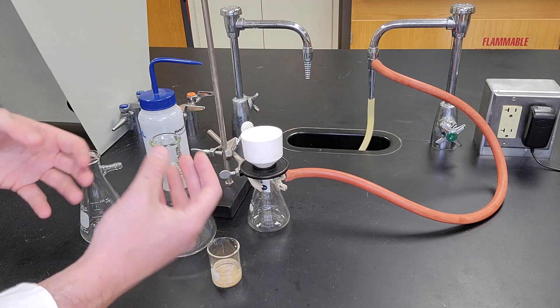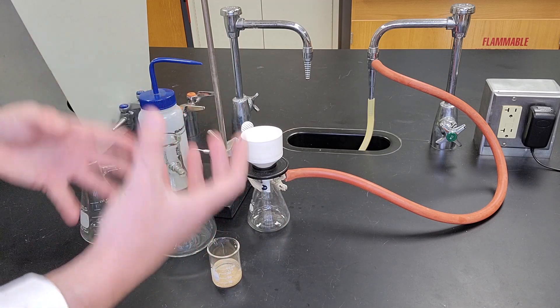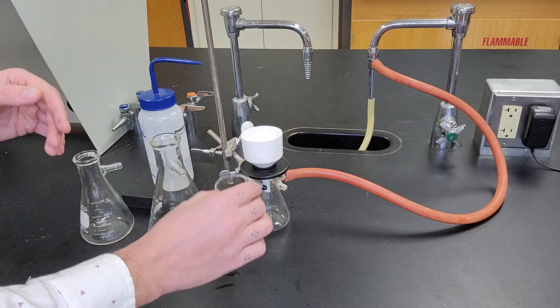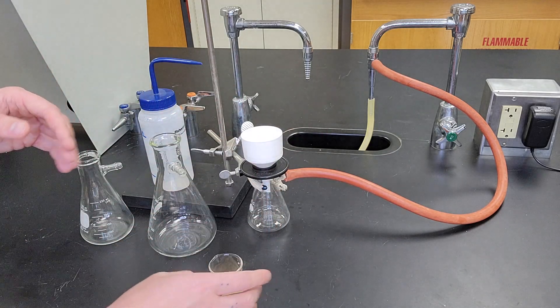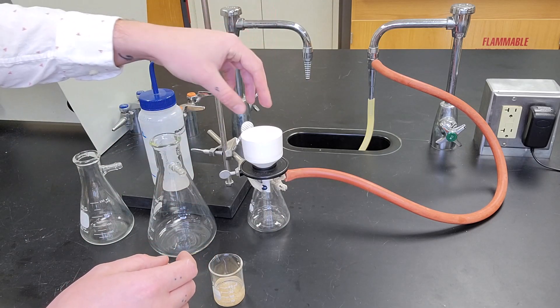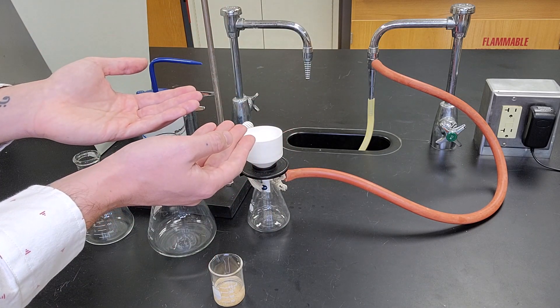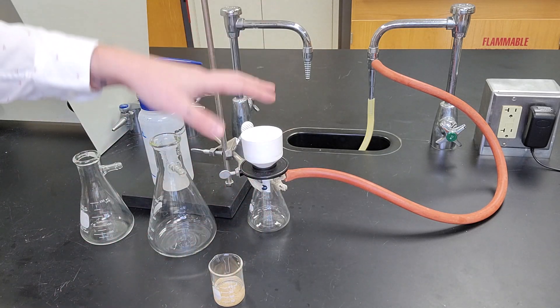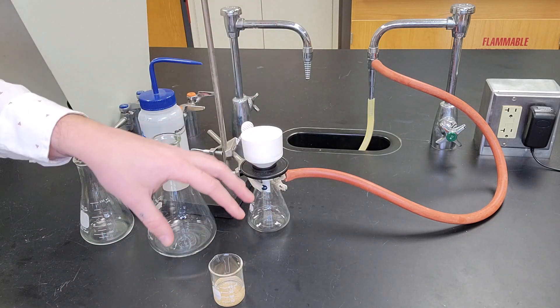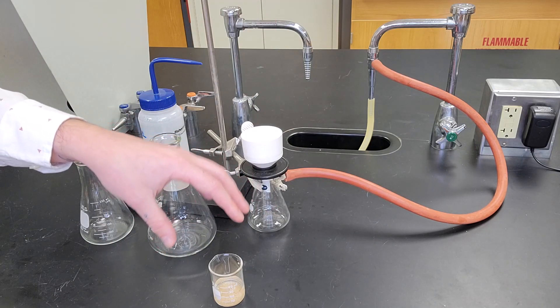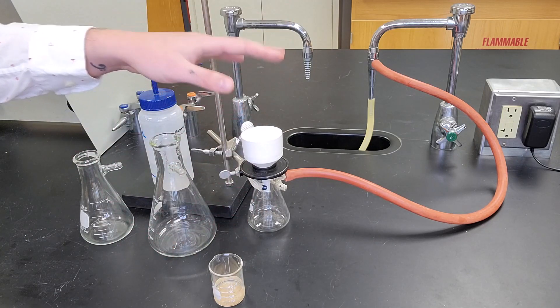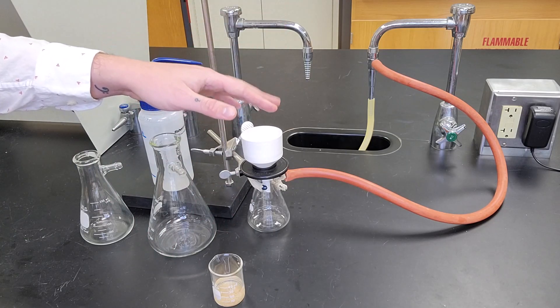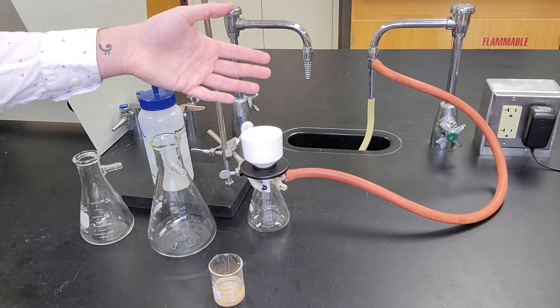What that's going to do is allow the filter paper to adhere to the Buchner funnel and create a seal, so when I do end up pouring my solution and heterogeneous mixture into my filter, it doesn't go around the outsides of the filter paper and fall through the bottom. We want to make sure we wash with solvent first to adhere the filter paper to the Buchner funnel, otherwise you run the risk of losing product.